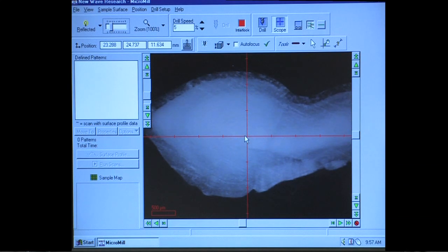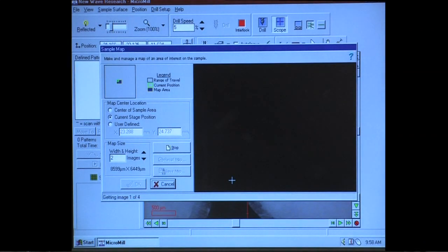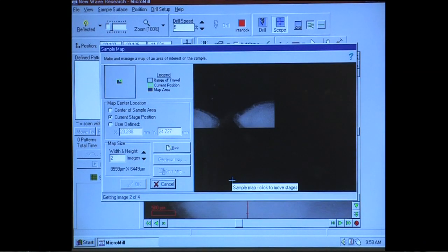Click on the sample map in the lower left corner of the screen, then click Current Stage Position, and then Make New Map in the window that pops up. The program will automatically make the map in four quadrants.